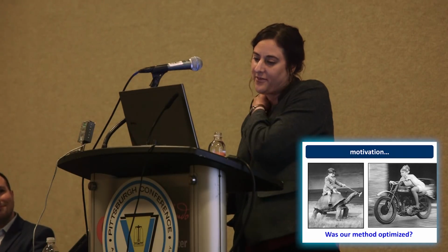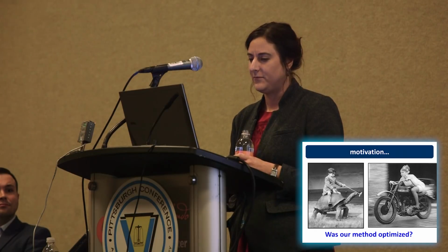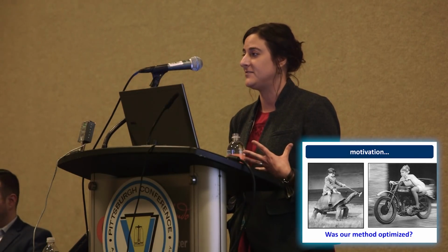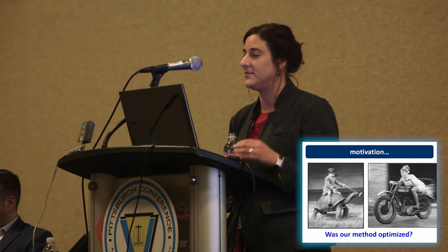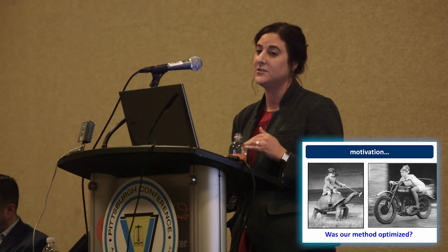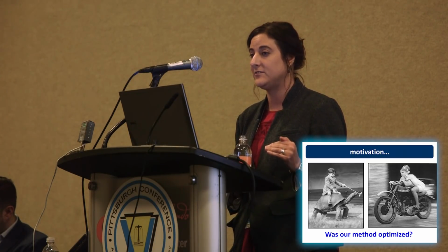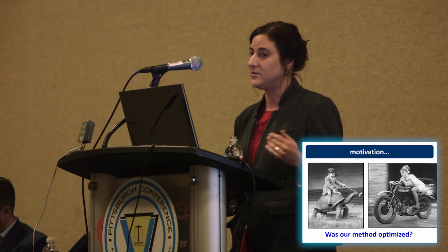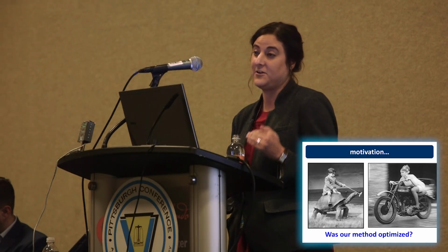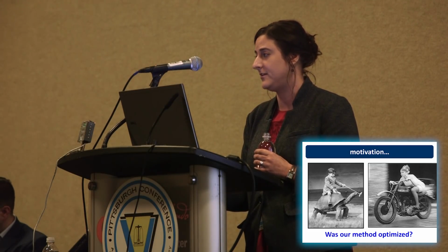When I started to assess our method, a lot of it's coming from chromatography, working for a chromatography company. Our method's 17 minutes. To me, that's unacceptable. That is where we make our money, is potency testing. There are some unique challenges right now in this particular assay because of the way we have to receive our chemical standards. They are limited in concentration. So oftentimes we are having to do multiple mixes at a single calibration point. In addition, we have a very wide range, and so we're having to do a lot of calibration points. Just the cal curve itself, if you have a long run, starts to take potentially half a day or a day. We can't have that. We can't function that way. So speed, obviously, is something that needed to be updated in my mind.